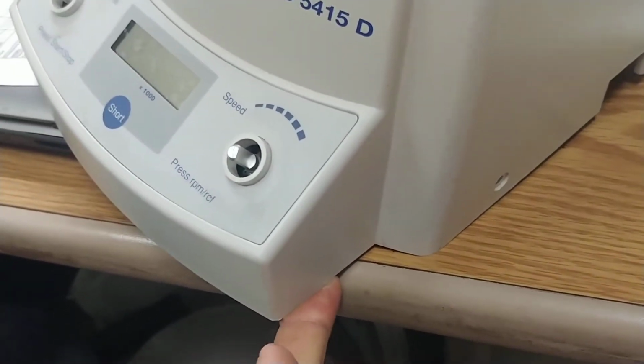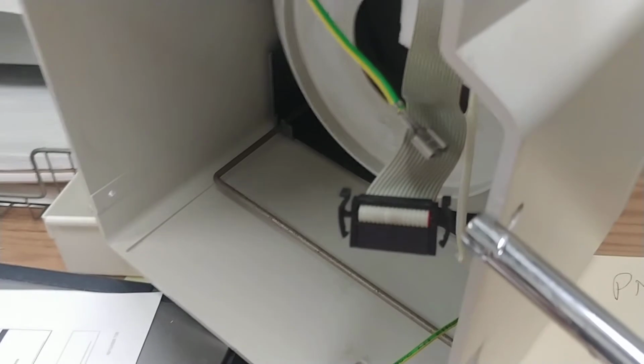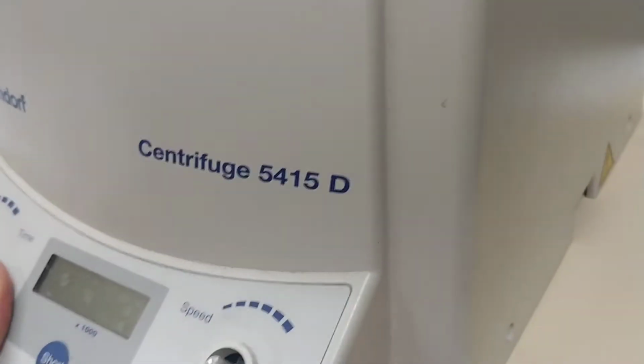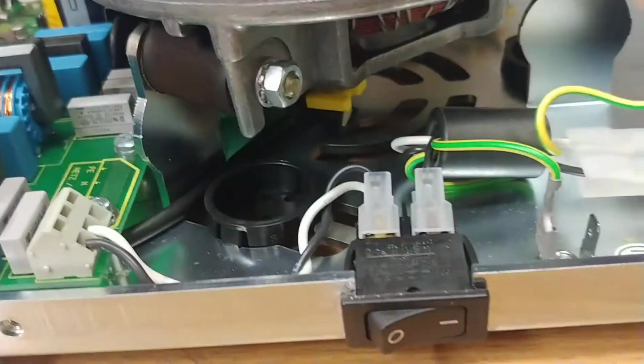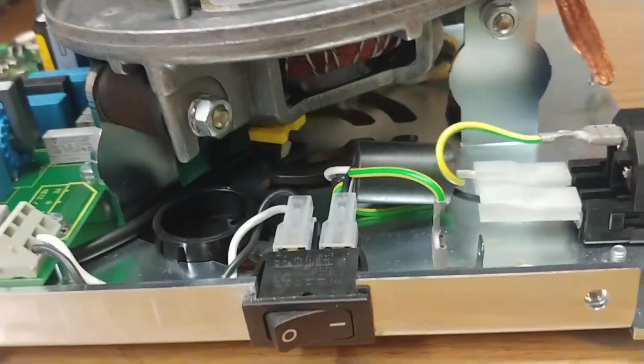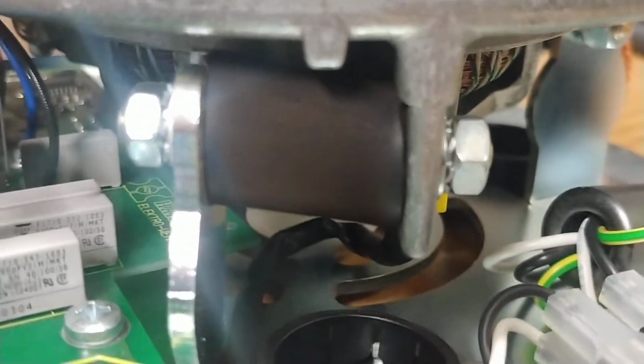So I put one of these like right there and gently let it drop to help push that upwards from its metal base. So maybe drop a 1/4 inch or so. Eventually one side broke loose, then I went and got the other side loose. Now to get at the repair, you see these, this is your rubber.